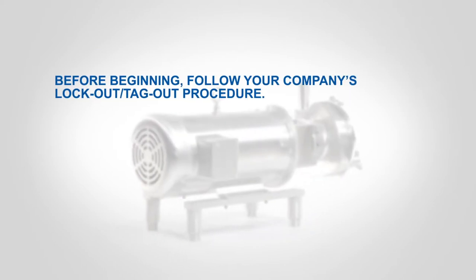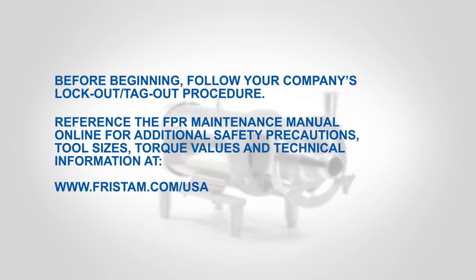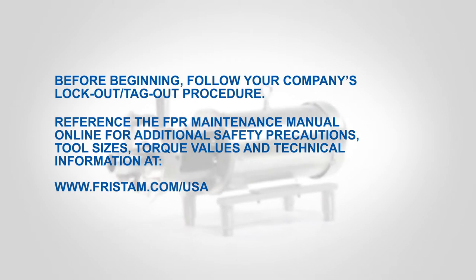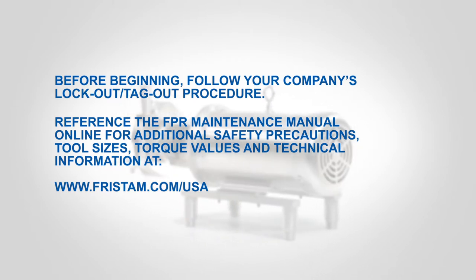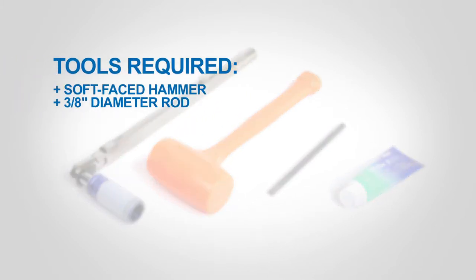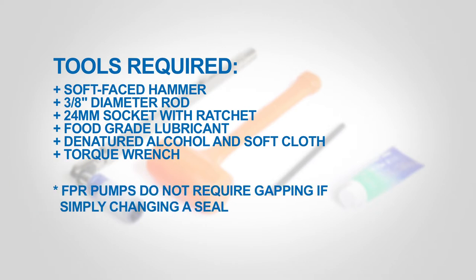Before beginning, follow your company's lockout/tagout procedure. Reference the FPR Maintenance Manual online for additional safety precautions, tool sizes, torque values, and technical information. Tools required: soft-faced hammer, 3/8-inch diameter rod, 24-millimeter socket with ratchet, food-grade lubricant, denatured alcohol and a soft cloth, and a torque wrench. FPR pumps do not require gapping if simply changing a seal.